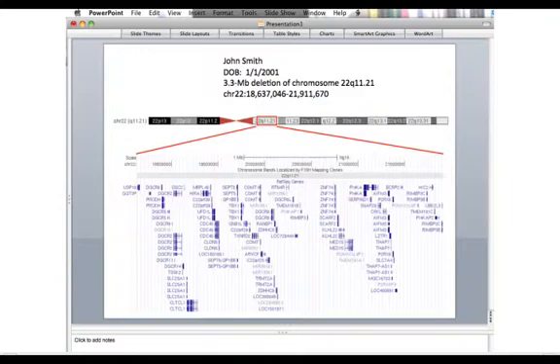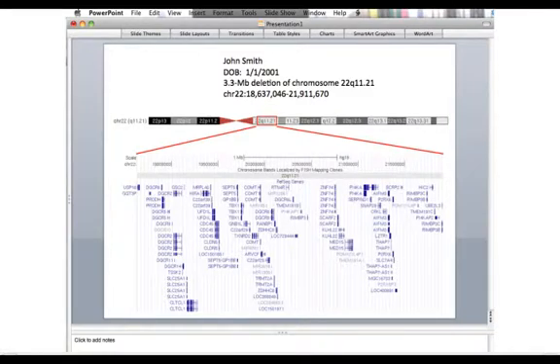This allows me to then print this picture out and share it with the patient, and hopefully it will give them some more details regarding what the microarray abnormality actually showed.